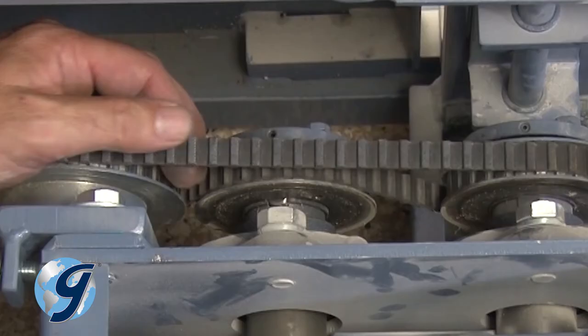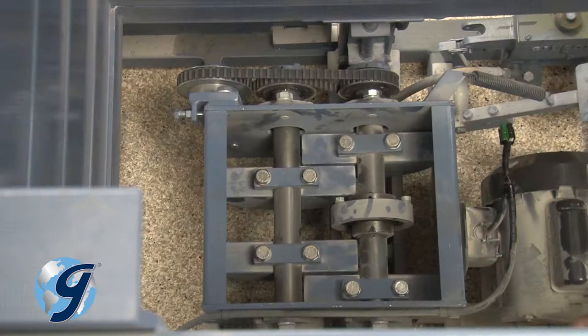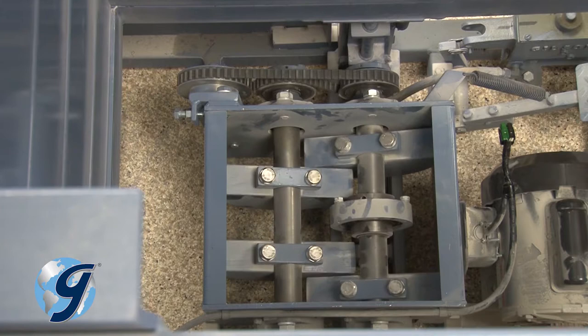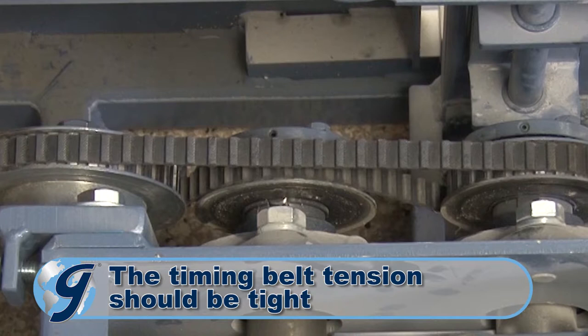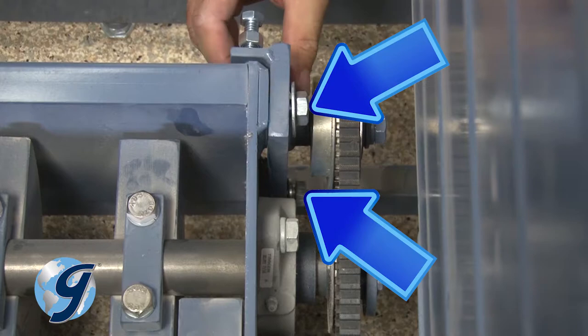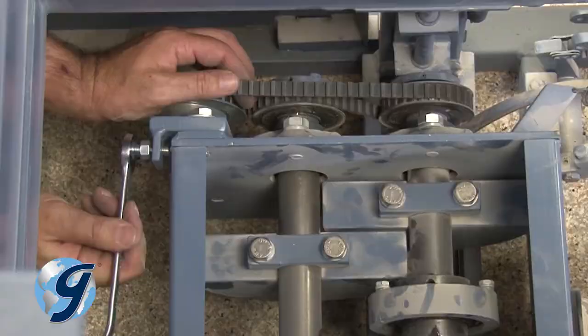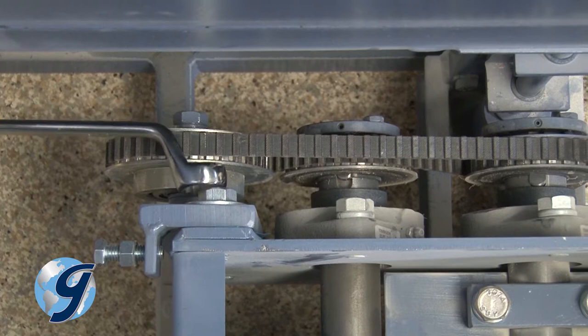Now check the timing belt. A worn or loose timing belt may slip teeth on the pulleys and cause the counterweights on the drive shaft and the counterweight shaft to become out of alignment. The timing belt tension should be tight. If you find the timing belt loose and the belt appears to be in good operational order, tighten the belt by first loosening the two bolts on the tensioning bracket and then turning the adjusting bolt.